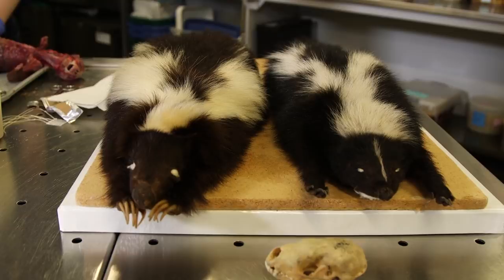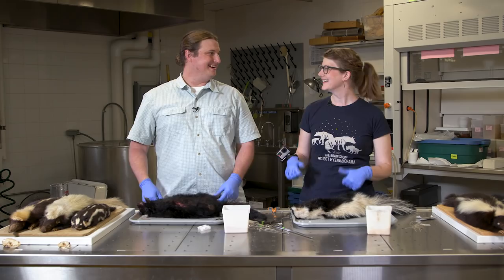We're here today with Dr. Adam Ferguson. We're going to skin some skunks.